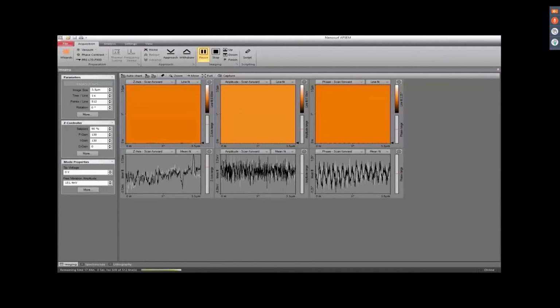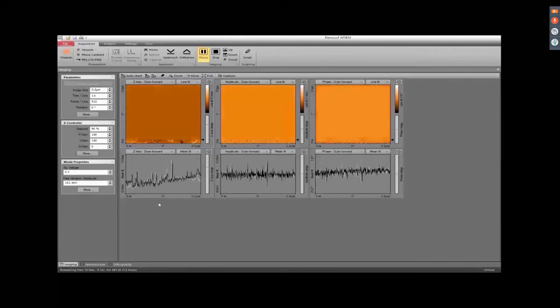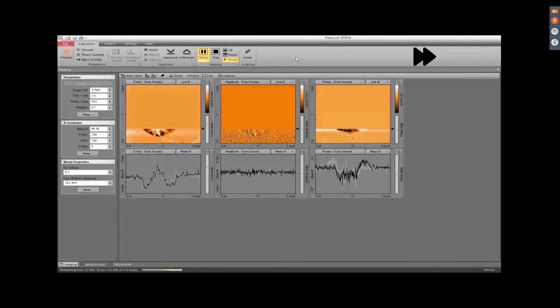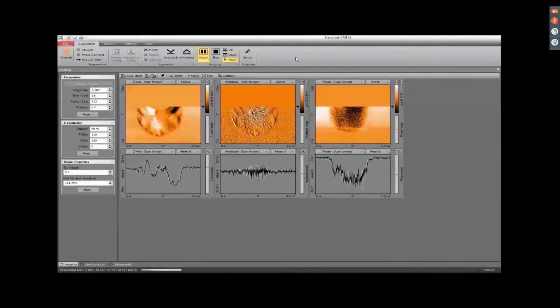Now you can see nice features appear, for example, some graphene wrinkles in the topography image, and a very interesting feature which can be seen in the AFM error image is the drum effect, which is revealed by amplitude instabilities in the center of the membrane.